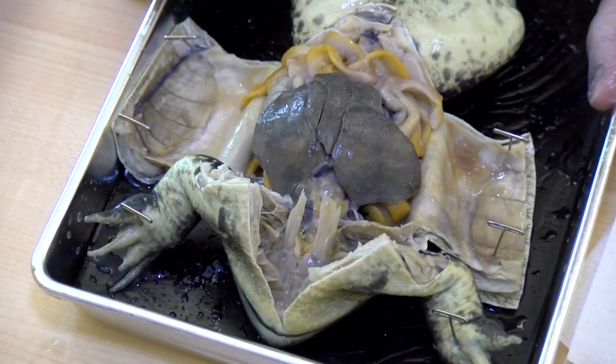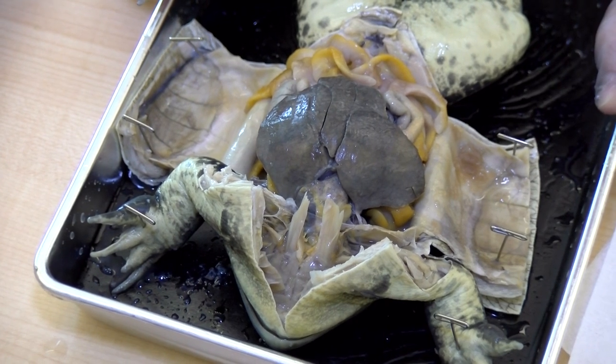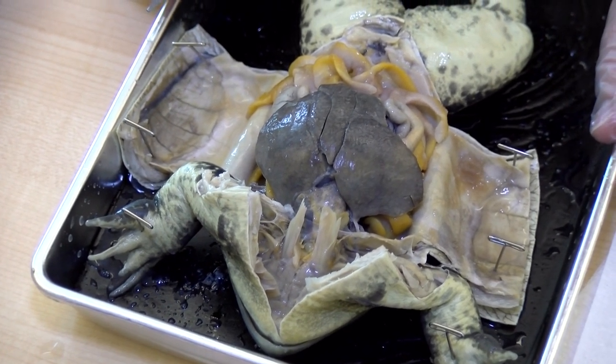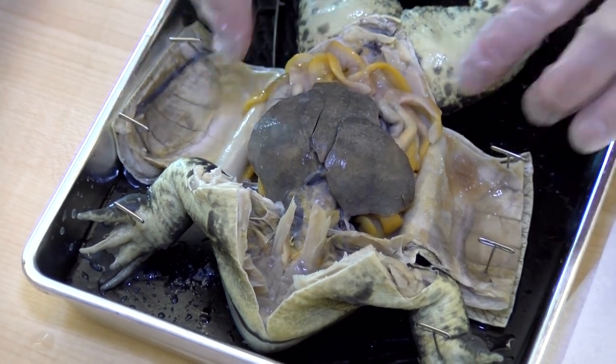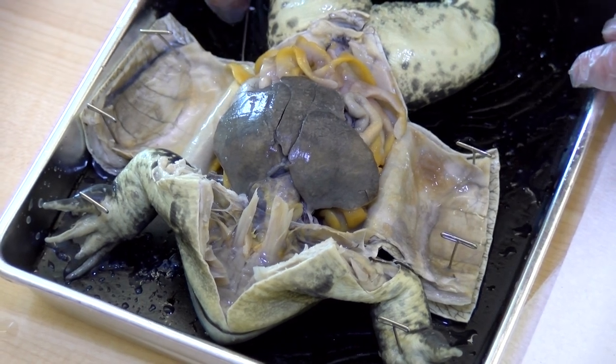The frog has been opened. We study a frog's digestive system because it's very similar to a human's — it has some of the same organs and follows the same path. Obviously the size is different and the way things are processed is different, but it allows us to see where the organs are located.